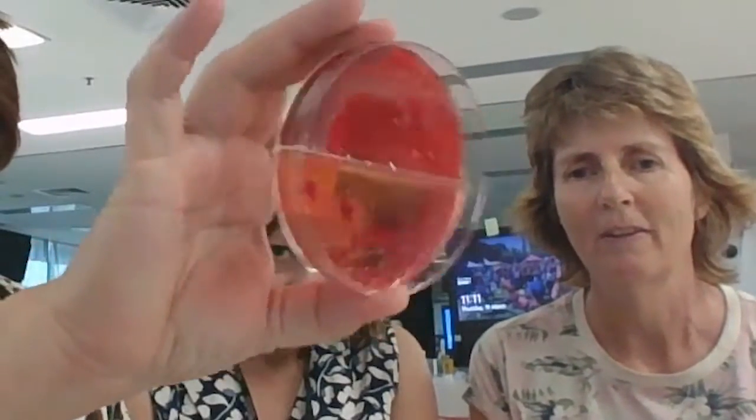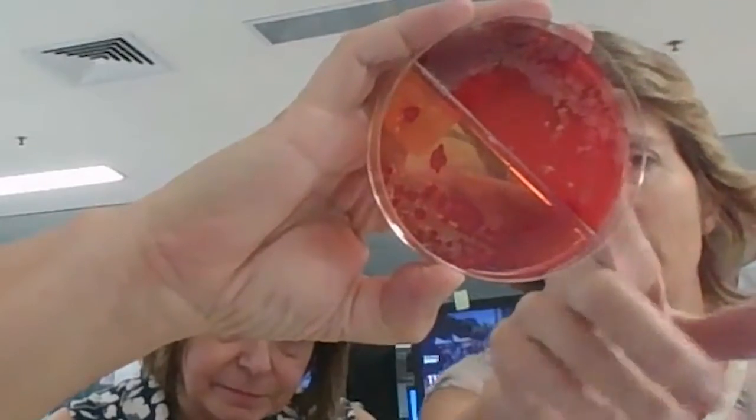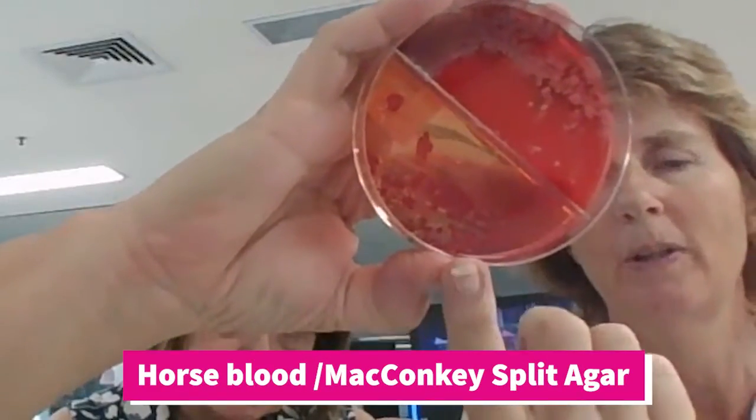And then we culture them with a tiny little loop. It's got a 1 microliter loop, and we put it on an agar plate. Oh, I think we might have one of the agar plates here. Oh, yeah, we do. So here is, I'll just find you. You can see one side. Do you want to describe it? This is a horse blood agar McConkey split. So this is horse blood agar here and McConkey agar here.